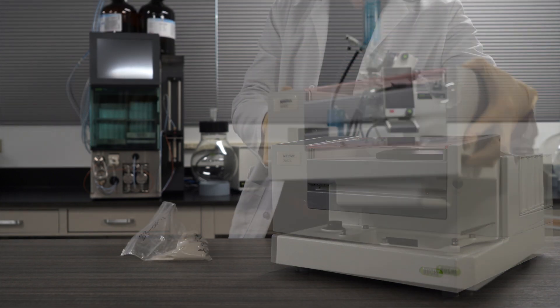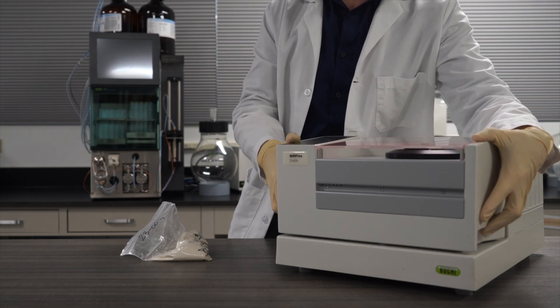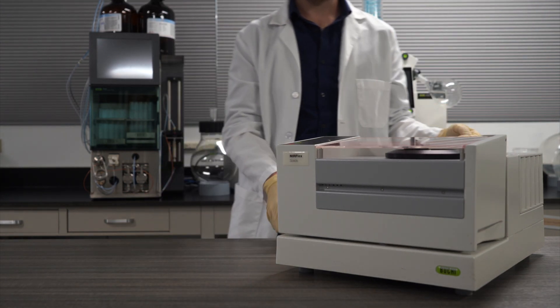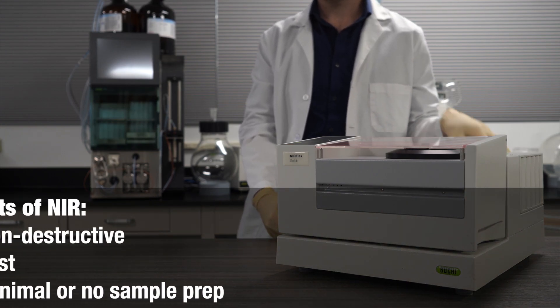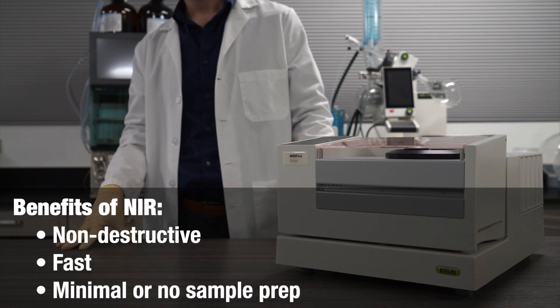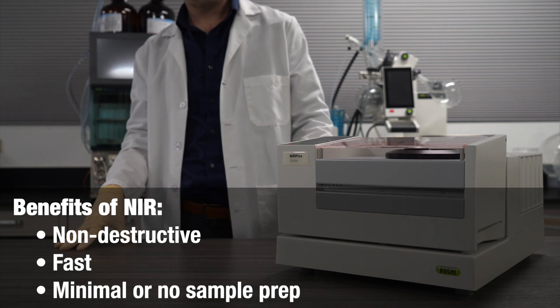NIR spectroscopy has long been used in the pharmaceutical industry for incoming raw material identity testing as well as for quantitative analysis and content uniformity testing. NIR is popular because it's non-destructive, fast, and requires minimal to no sample preparation.